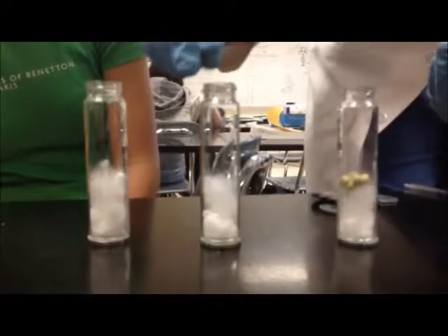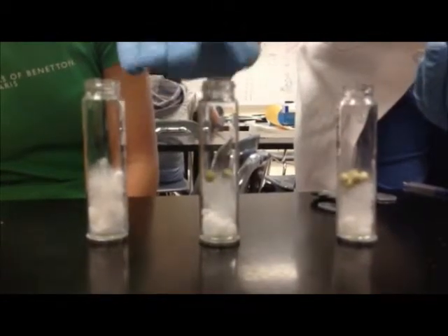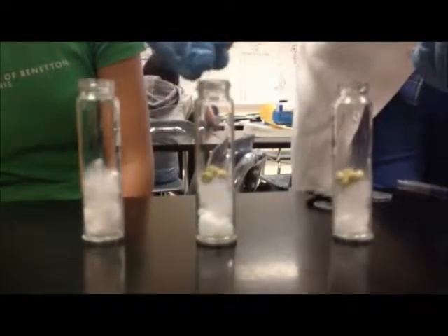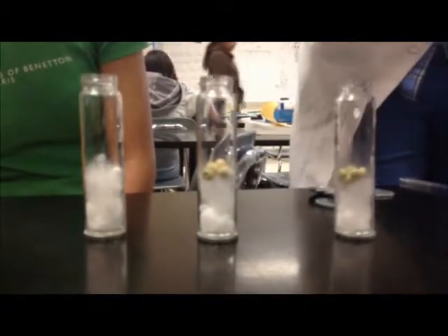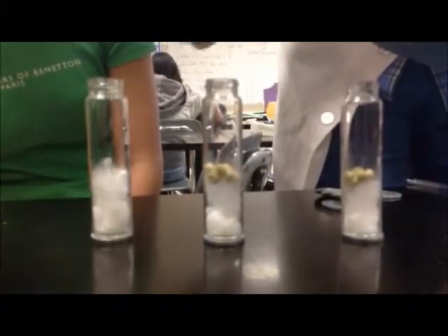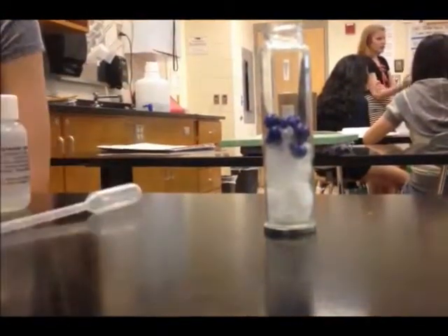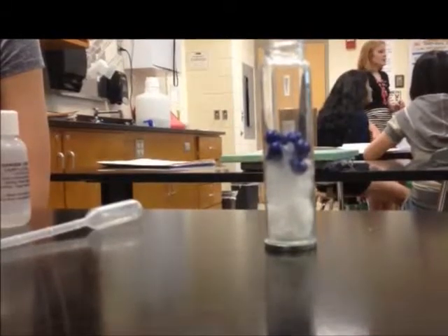Then we put each of the 5 milliliters of peas from each molarity solution into a different respirometer to serve as a way to measure the respiration of each of these different peas in different solutions. Then we add 5 milliliters of beads to one respirometer to serve as a control in this experiment.